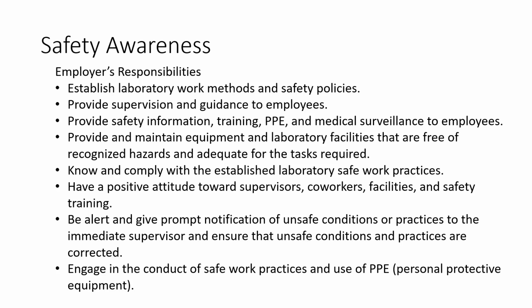Employees should know and comply with the established laboratory safe work practices, have a positive attitude towards supervisors, coworkers, facilities, and safety training, be alert and give prompt notification of unsafe conditions or practices to the immediate supervisor and ensure that unsafe conditions and practices are corrected, and engage in the conduct of safe work practices and use of PPE or personal protective equipment.